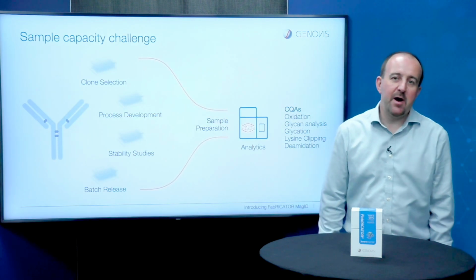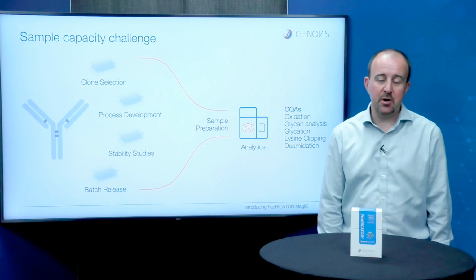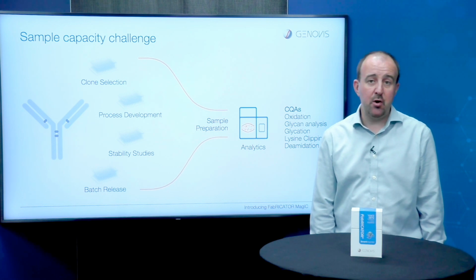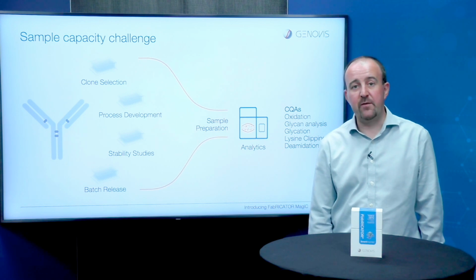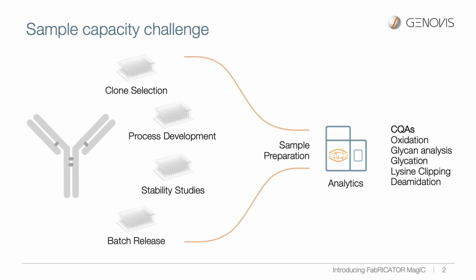So we all know that biopharmaceutical molecules or biologics are large and complex molecules. They are difficult to characterize and they undergo post-translational modifications throughout the process of their development. That needs to be analyzed, and often we would use, for example, an LC-MS instrument. But prior to that, we need to prepare the samples in a specific way. This creates quite a challenge, both the sample preparation and the LC-MS step.